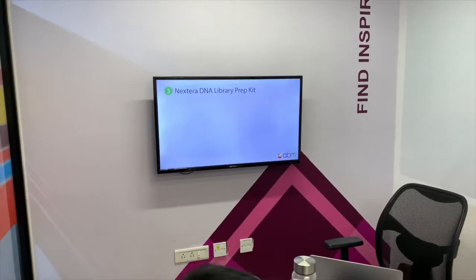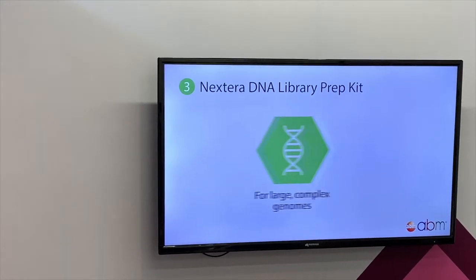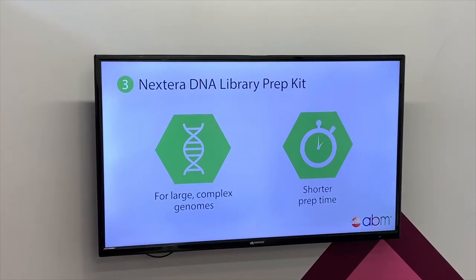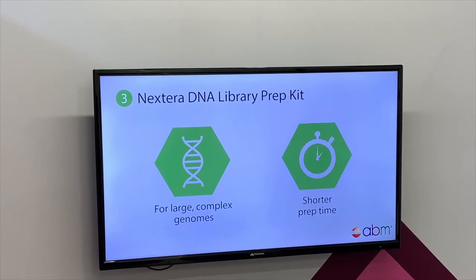3. Nextera DNA library prep kit, ideal for large, complex genomes, for example, the human genome, and provides a shorter sample preparation time relative to the TruSeq PCR-free and Nano library prep kits. The protocol is similar to the TruSeq Nano DNA library prep kit.